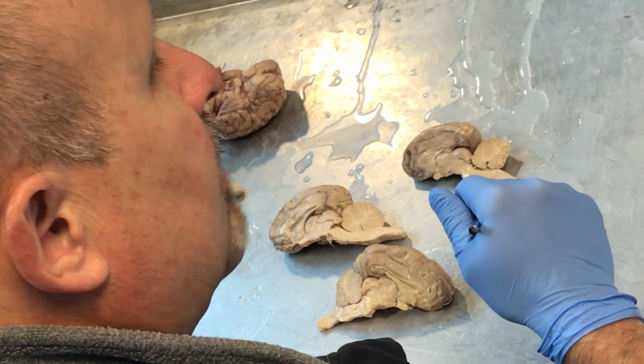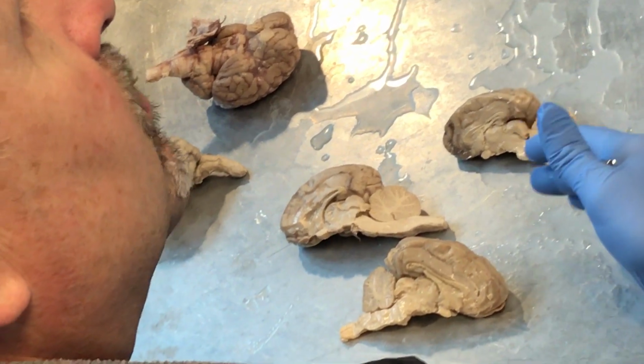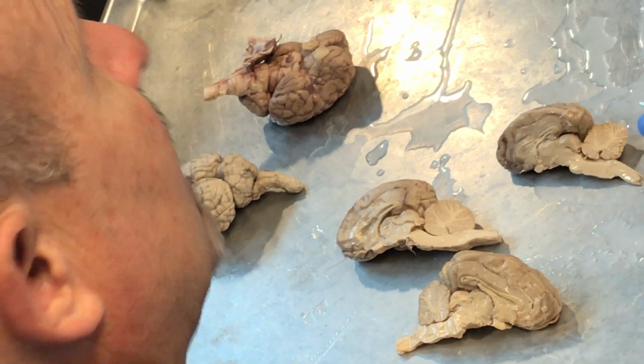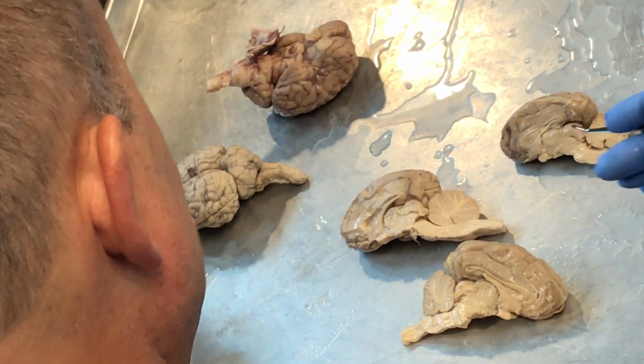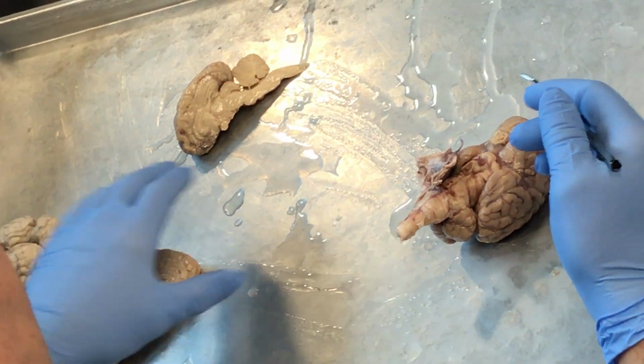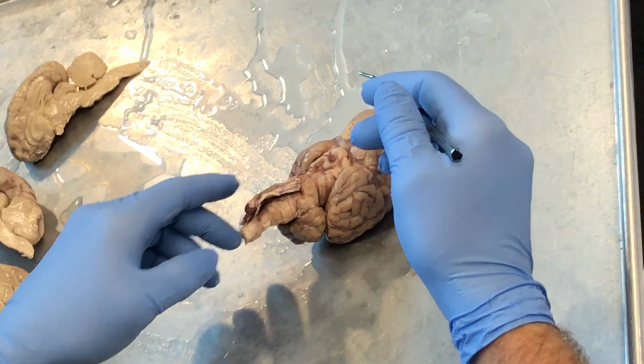Okay, first thing we need to talk about, meninges. Meninges are the outer coverings of the brain. There are actually 3 layers to it. You've probably heard of meningitis. Meningitis is the inflammation of those meninges. So the first one, as you can see, is the outer layer. The outer layer is called the dura mater, and you can see a little bit still attached here.